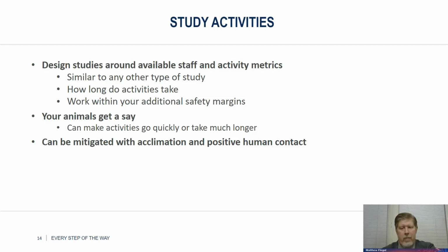So let's take an example. I want an ECG measurement and a pharmacokinetic blood sample at 2 minutes after dosing. And I can accept a 30-second variance. I can probably get an ECG waveform, and I can probably get the blood within that 30-second window. So I take the ECG at 1 minute 45 seconds after, and then I immediately start the blood collection. But if anything goes wrong, you lose everything.